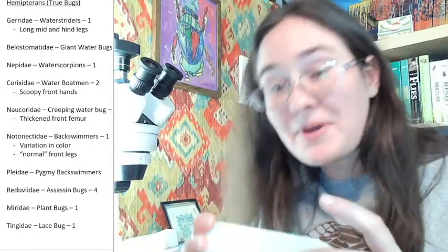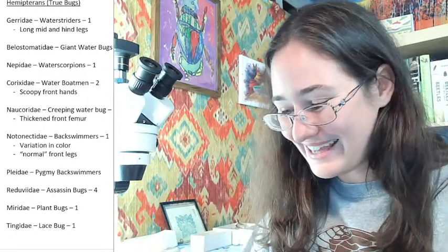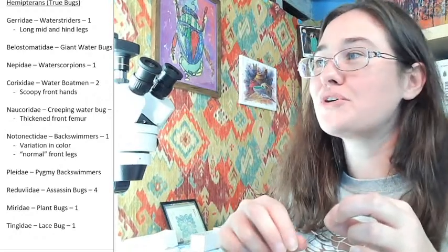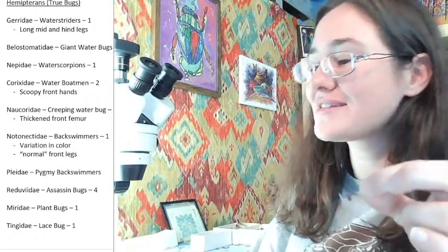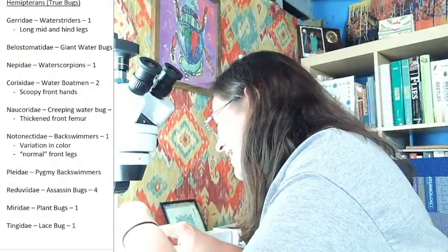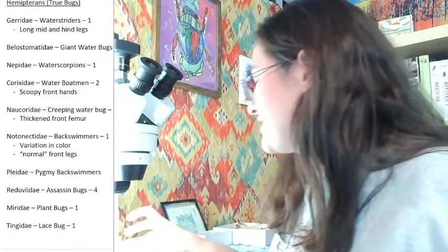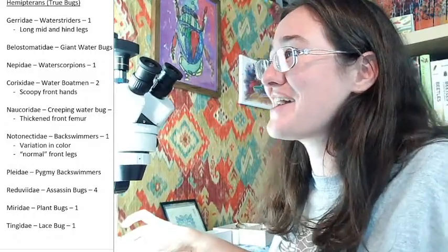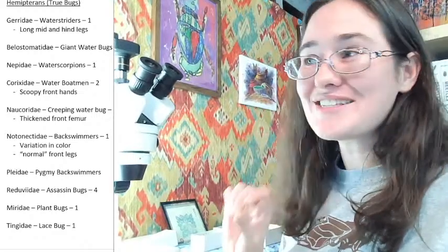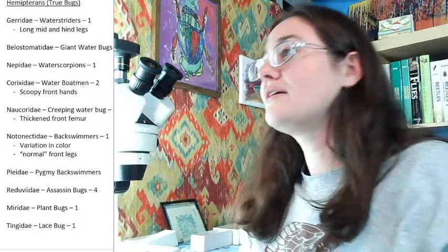Alright, so I'm going to admit, this is going to be one of my oldest specimens. It was collected when I was a kid, before I realized that the pronotum was the first segment of the thorax, and not where you were supposed to put the pin through. So, you guys can laugh, when you see that this pin is through the pronotum instead of the actual second segment of the thorax. All right. So this insect is going to be a Lygaeid.